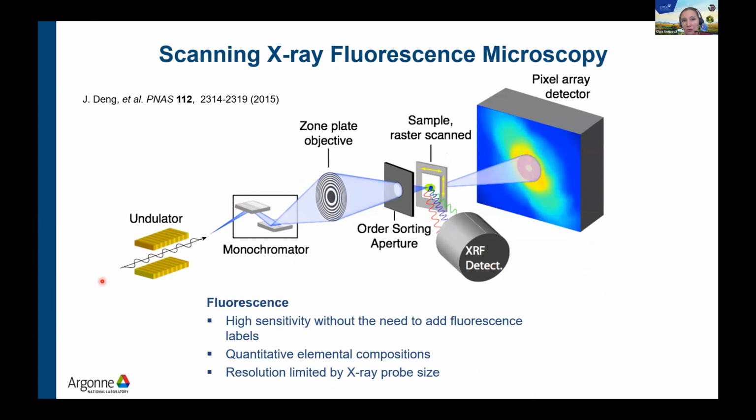Moving on to the scanning X-ray fluorescence microscope. When we have a synchrotron, we can generate a lot of X-rays, so we can use optics like zone plates or KB mirrors, which squeeze X-rays into a tiny spot, below 1 micron or a little bit above 1 micron. This process of focusing results in a loss of photons, sometimes relatively dramatic. That's why super high resolution, super tight focusing makes sense with synchrotron X-ray sources. It wouldn't quite work with tabletop devices.